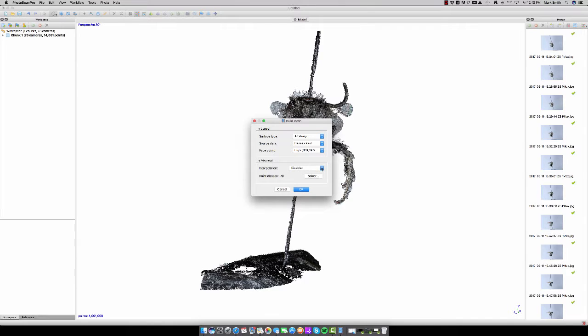The interpolation, we have it on disabled. That basically means that if there's any data missing, any points missing anywhere along the structure in the dense point cloud, for example, if I point out this area right here of the stage, there's missing information, there's a hole. If this is disabled, the software is not going to try to fill in that hole for us, which is what we want. We want that to be disabled because we don't want the computer to predict what isn't there for us, if it's not a concern, and if it's not going to accurately represent the scientific information we're after.